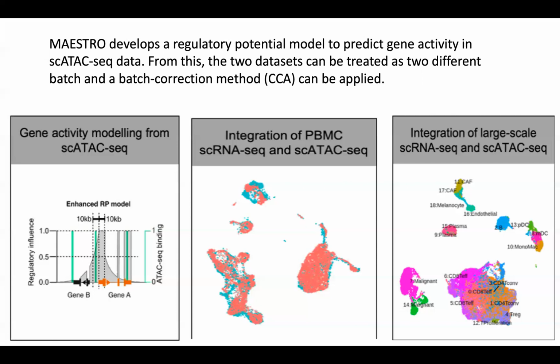So this is a little bit complicated. How can I explain this better, or is this making sense, what the goal of this is? Annotating cell types is a little bit difficult in single cell ATAC-seq. So the goal of this method is to use the single cell RNA-seq to help us annotate cell types. Does any part of this need more explaining?